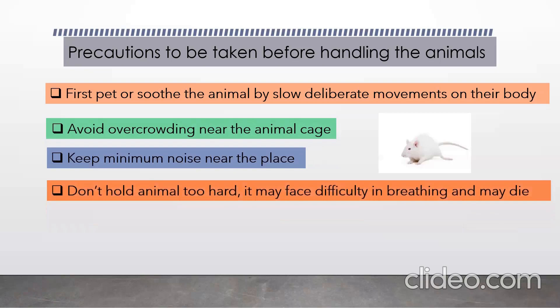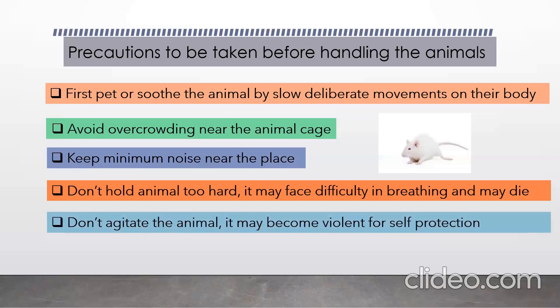Don't hold the animal too hard, as it may cause difficulty in breathing and the animal may die. Keep it comfortable. The last point is don't agitate the animal — it may become violent for self-protection.